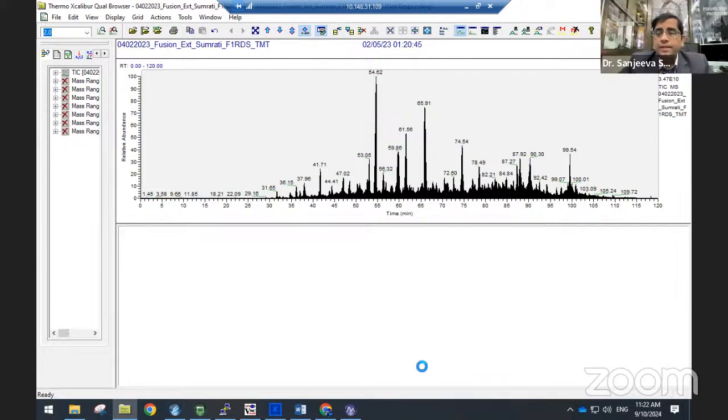All right. These are the live runs which our colleague is about to show you from the Orbitrap Fusion, on which we are acquiring the data. To really get proper fragmentation and look at the reporter ions, you need to optimize the collision energy and do a lot of optimization at the chromatography level and the MSMS parameters. But eventually, if your labeling was highly efficient and you have done the proper labeling, you can look at the data and acquire a lot of good quantitative accuracy.